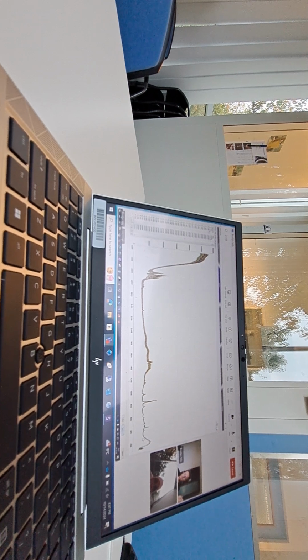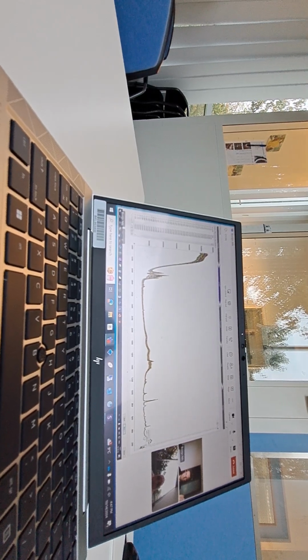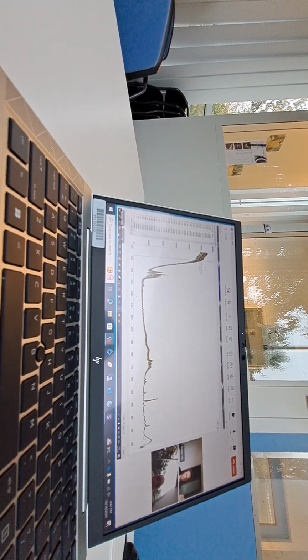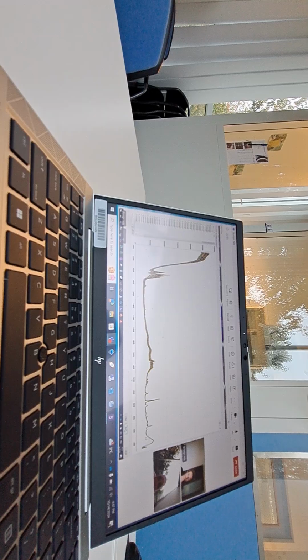So normally, what region do you select? Well, in this case, I would do from here to here, because this is nothing. Just noise, no information. Same here. So you could remove these.